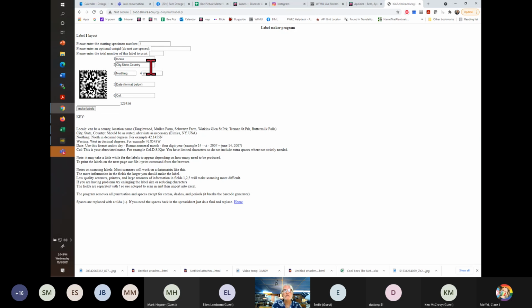In museums, often you put a det label on every specimen. In the kinds of collections that a lot of us are involved with, you have unbelievable numbers of some species. So putting a det label on every one doesn't quite make sense, particularly if you're going to chuck a lot of them and keep just a small number. Also, they're difficult to read, like if you're doing data entry. So we usually fill out a det label, pin it by itself in front of a row of specimens.